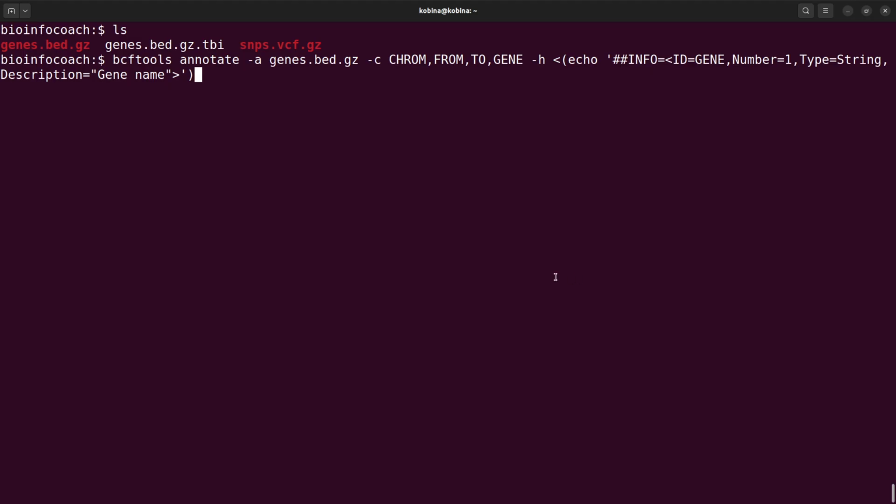You can just copy and paste as well. That's also fine. This is how it is supposed to be.